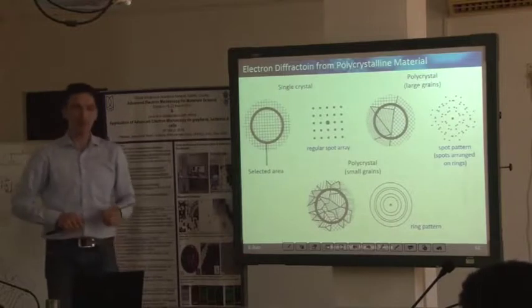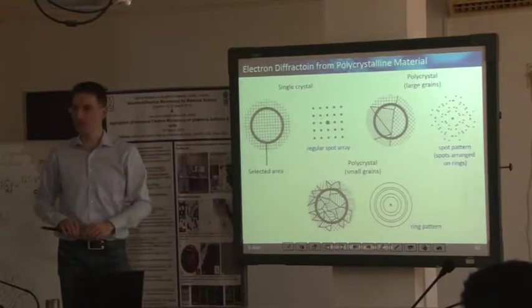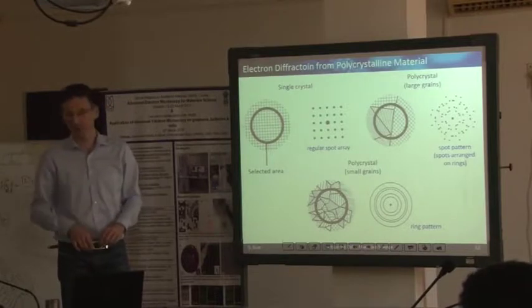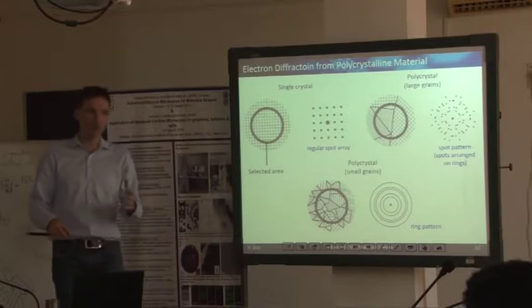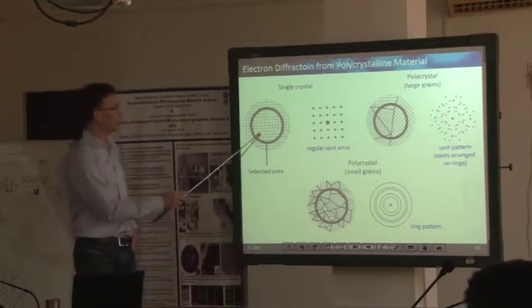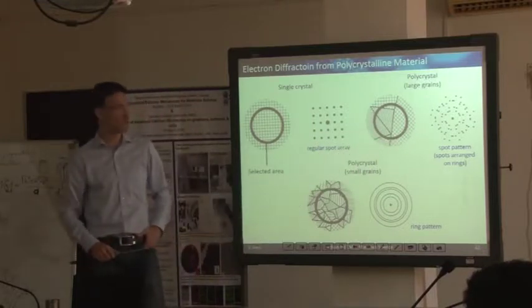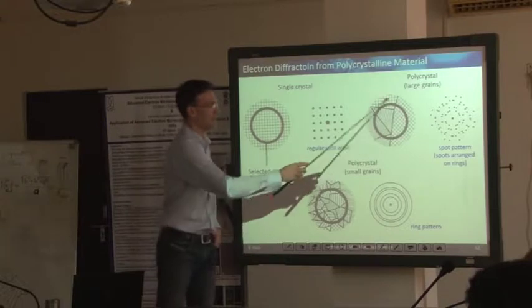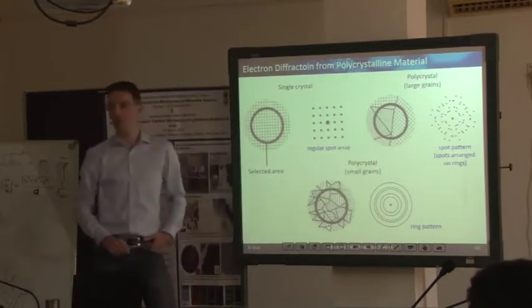And now we have to think about what we would see if you have a polycrystalline material. For a single crystalline material, this is pretty clear, because just defining this area would lead to almost or very similar diffraction. But assuming that you have a polycrystalline material, like a coarse grain with several grains, you would see some more reflections.